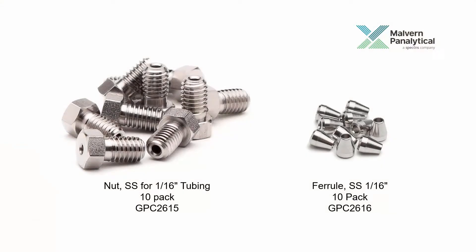This video will demonstrate how to make one of these fittings using a stainless steel nut and a stainless steel ferrule on the end of a piece of Teflon tubing. The nuts and ferrules are available from the Malvern Panalytical online store and can be located by searching for the names and part numbers listed here.